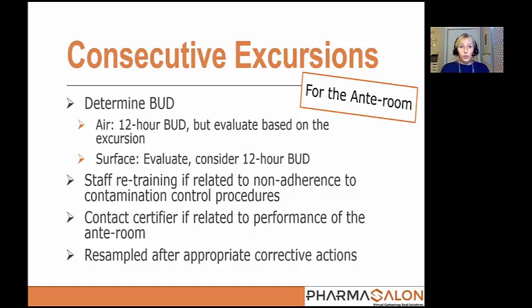Things that you want to make sure that you do, though, is really ensure that staff are appropriately trained and go back and dig to make sure that there are no issues with adherence to contamination control procedures. So everybody is following all of the garbing requirements. People have good clean room behavior, slow movements, not excessively talking, not bringing cell phones in, right? And that people are also following all the material handling procedures. So depending on what you're seeing from an organism standpoint, you want to gear your investigation to that.